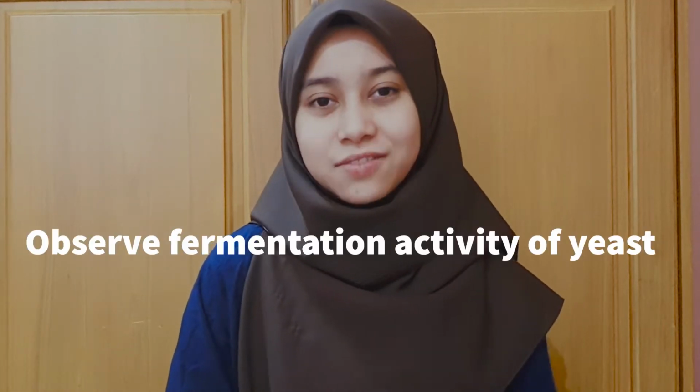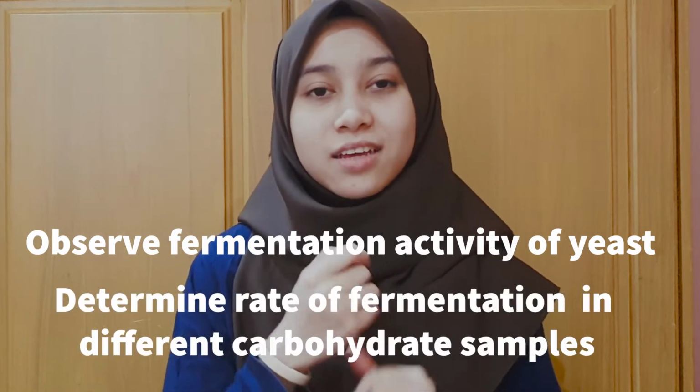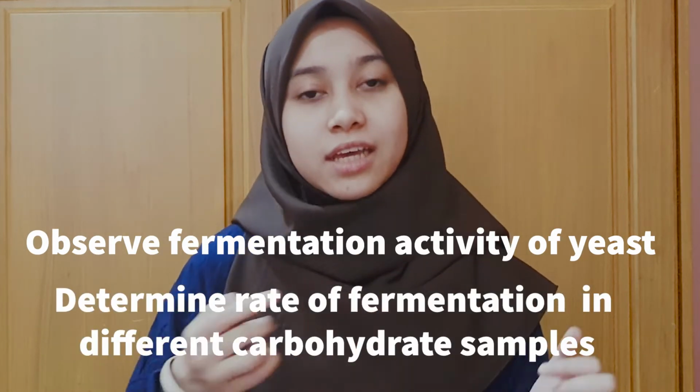The objective of this experiment is to observe fermentation activity of yeast and find the rate of fermentation of yeast in different types of carbohydrates.